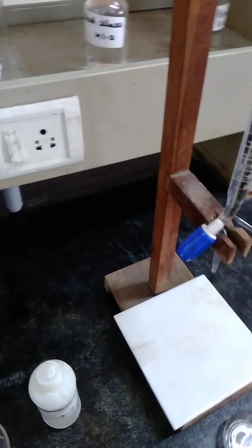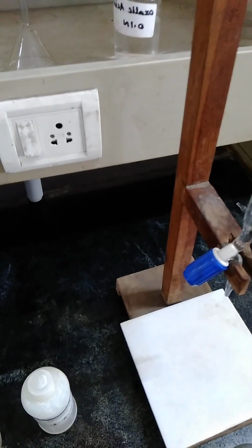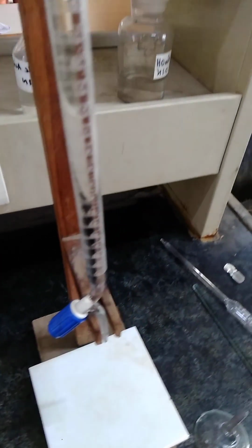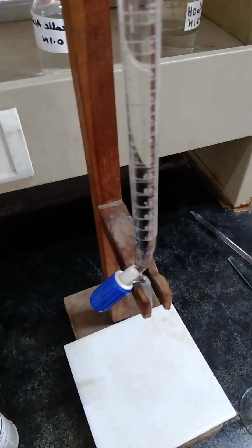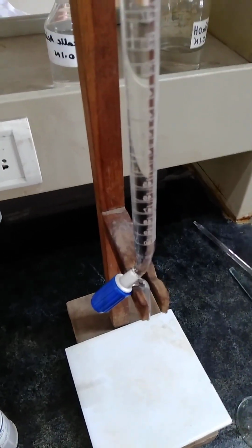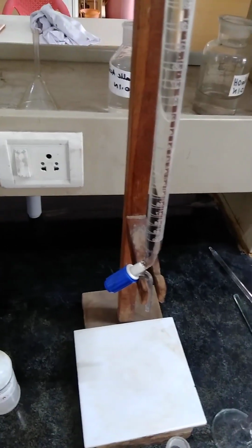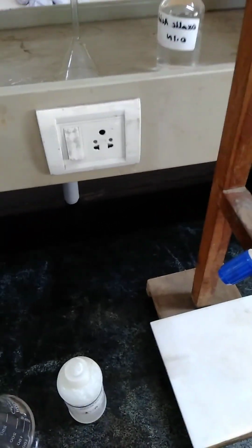In the 11th and 12th standard you did the titration with one known solution and one unknown solution. The known solution gives the normality, and for the one whose normality you don't have, you calculate the normality and the amount of the particular unknown solution. Here we are going to do the same thing. We have these two solutions, the burette solution and the prepared solution, and both normalities are unknown.